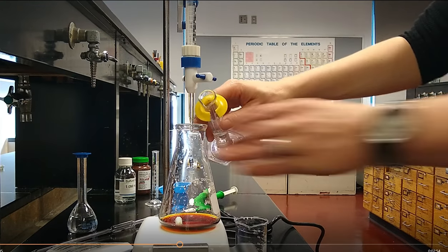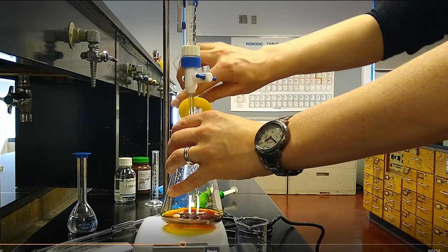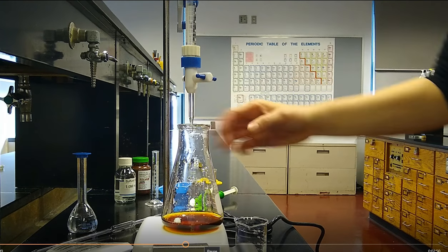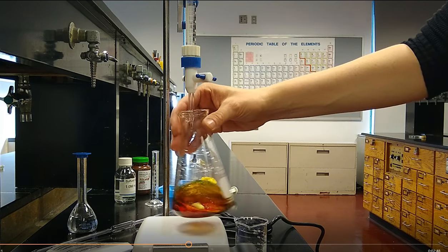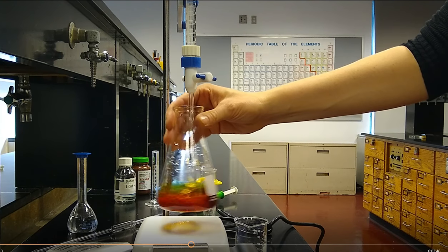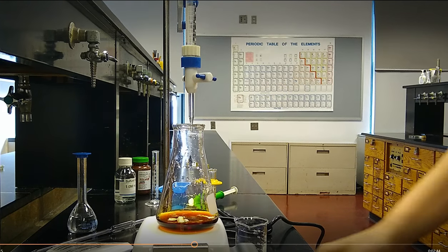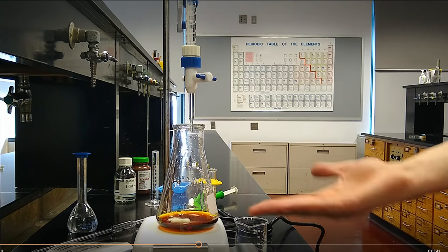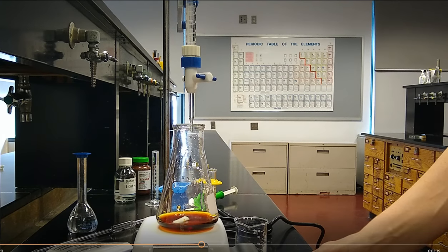Last but not least, we add in some tap water just to provide more volume for the solution to take place in. We do not need to measure that carefully. Give it a swirl, make sure that it's well mixed. But of course you're going to just use the stir bar feature and get it stirring.